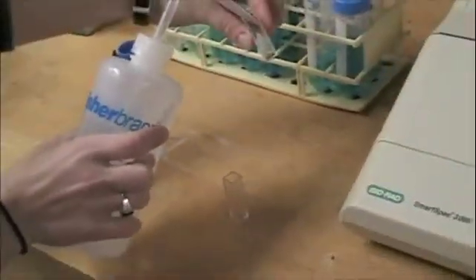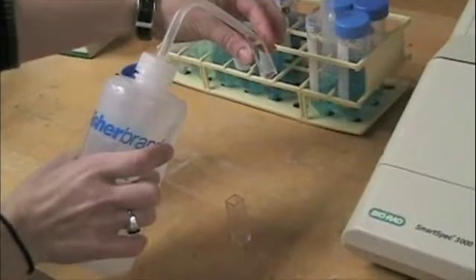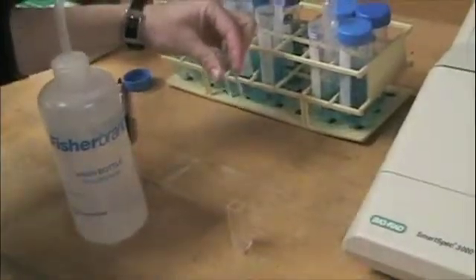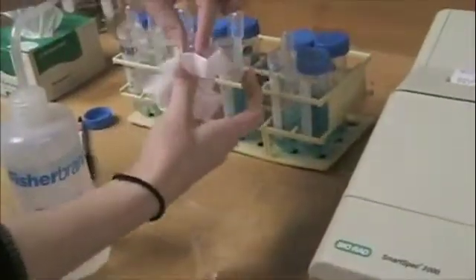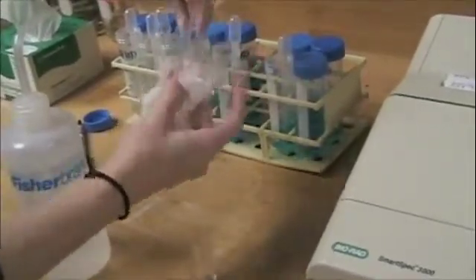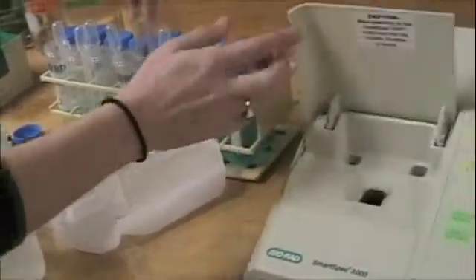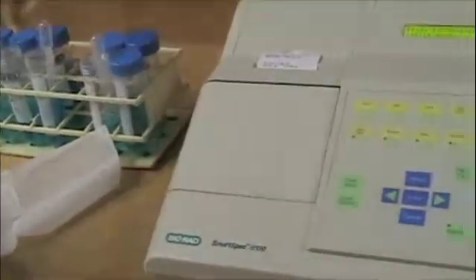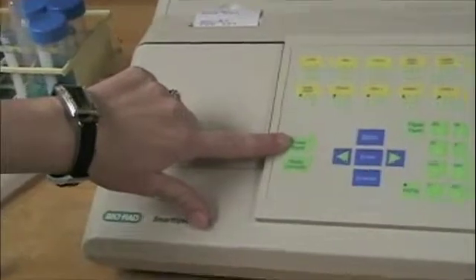It asks me to read the absorbance, but before I do that I want to blank it. To set up the blank, I'm going to take my cuvette and fill it just with water from a squirt bottle — this is DI water. I want to make sure there aren't any fingerprints on it, so I'm going to take a chem wipe and wipe it off, because fingerprints could change how the light is absorbed through the sample. I'll place it into the spec with the clear side facing me and close the door, then press this read blank button.